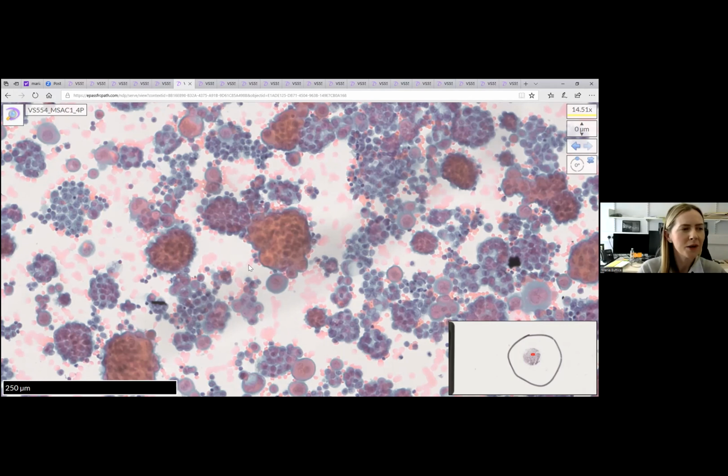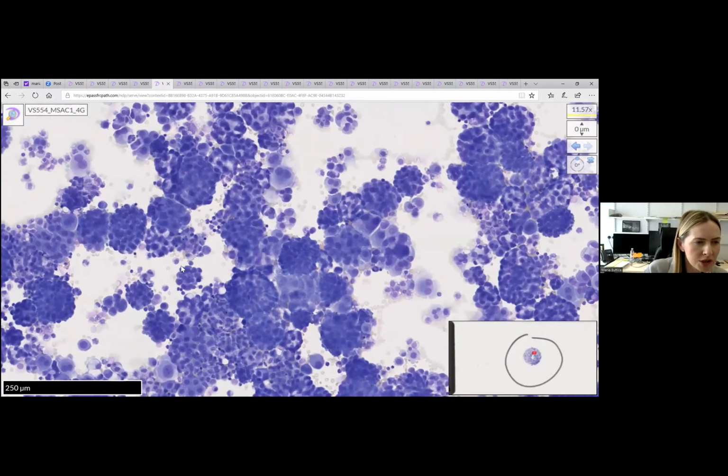Absolutely. Maria, so well chosen. Yeah, so this is actually a case of an atypical mesothelial proliferation, and we can talk about what allows us to distinguish them as mesothelial over adenocarcinoma, but I totally appreciate that it can be a differential, and sometimes we can have adenocarcinomas that mimic mesotheliomas and vice versa. But essentially, as someone correctly identified, we had Mulberry-like clusters. I think they were better appreciated here on the MGG. So can you see that the outline are Mulberry-like, sort of humps rather than smooth?